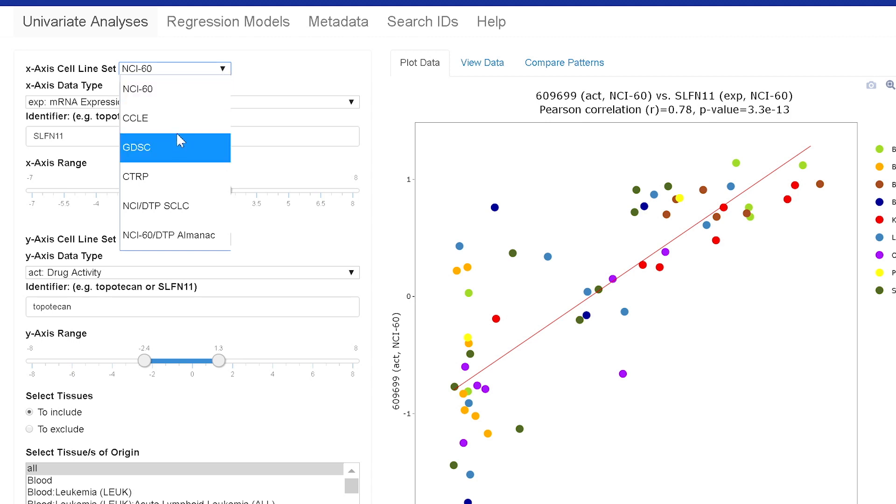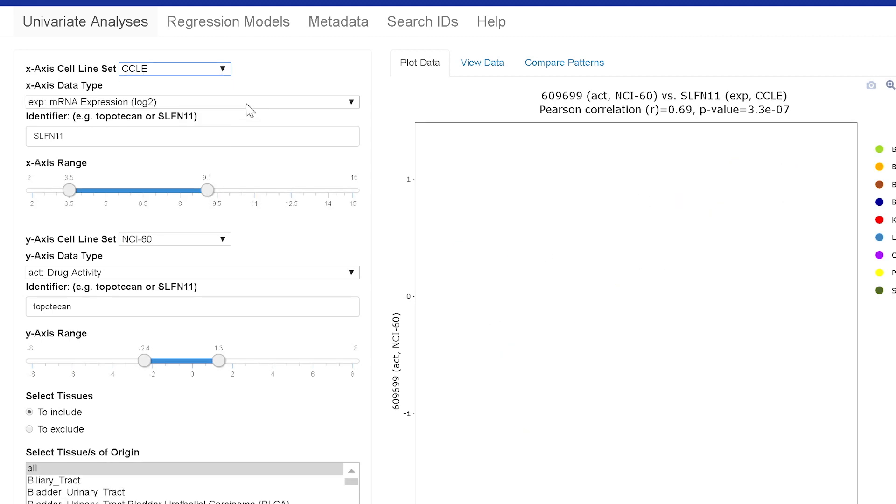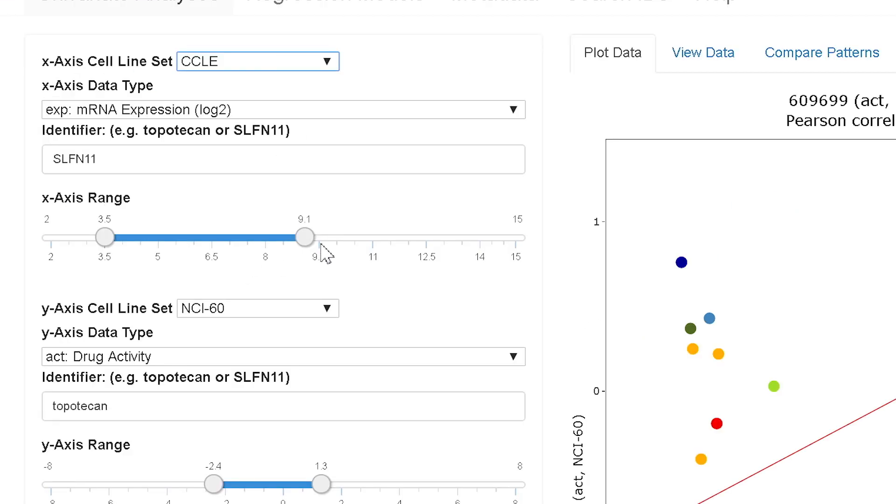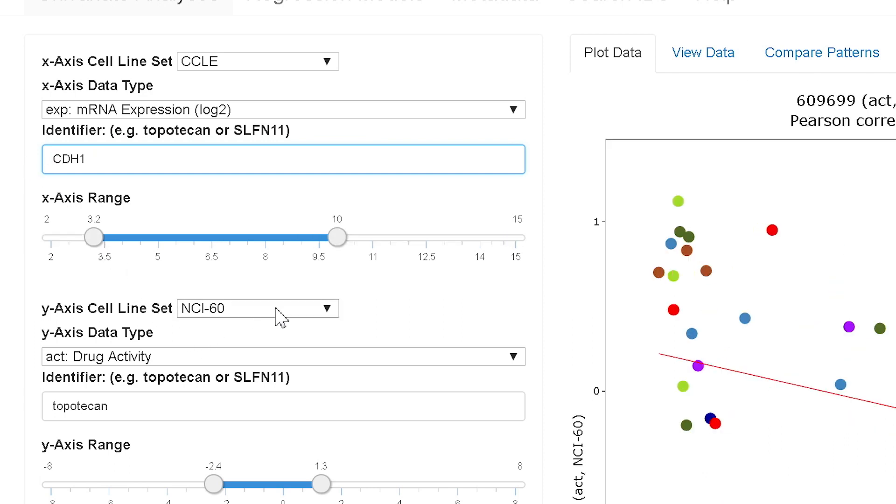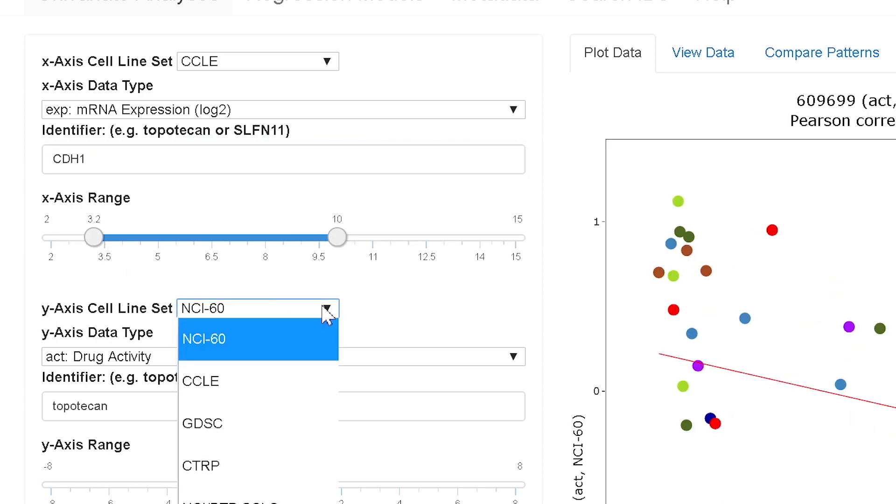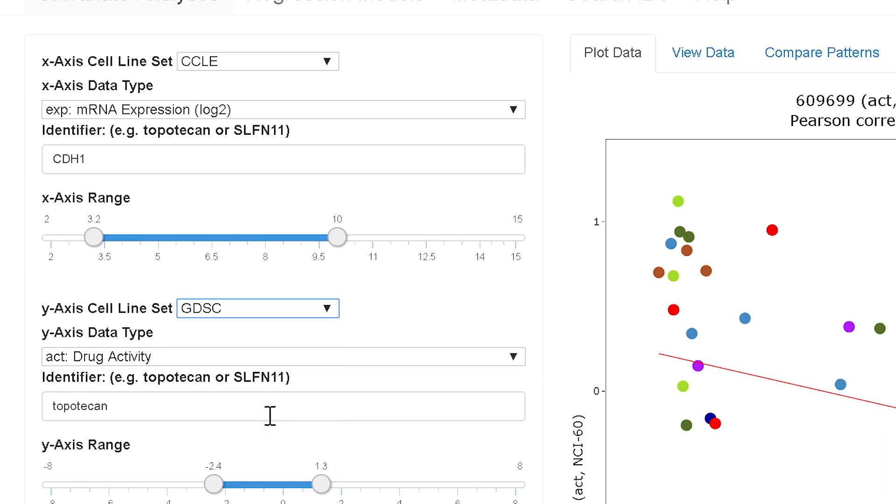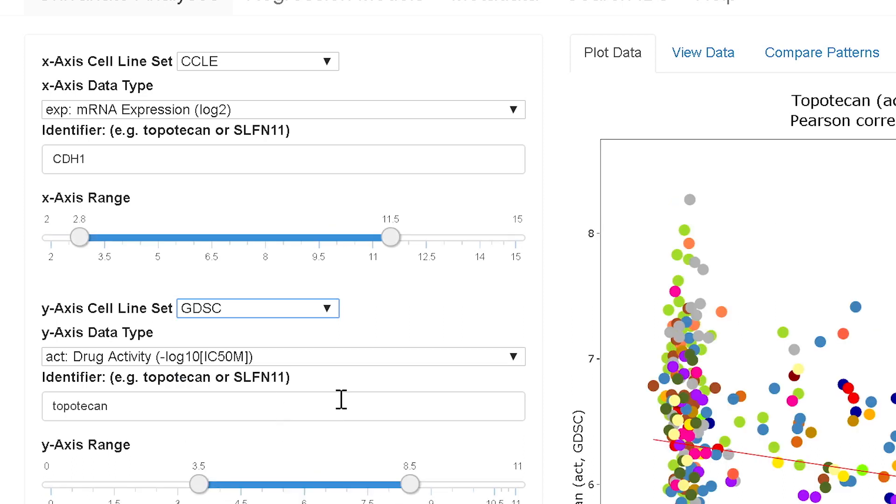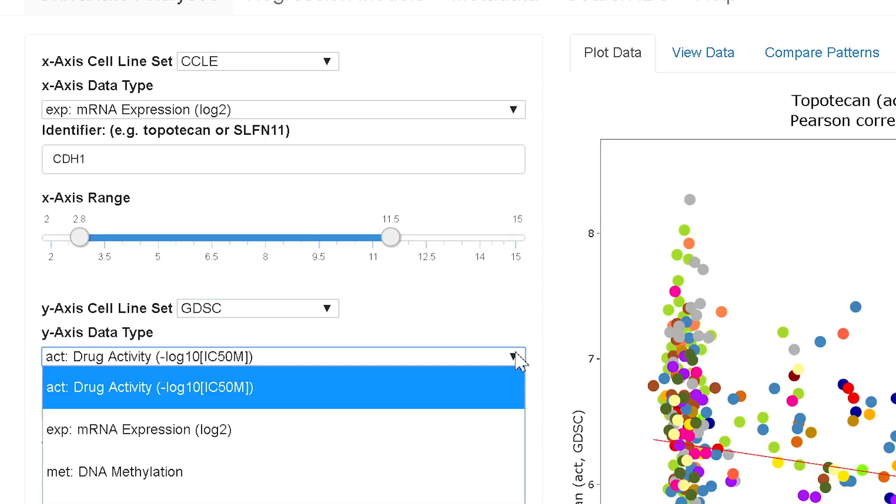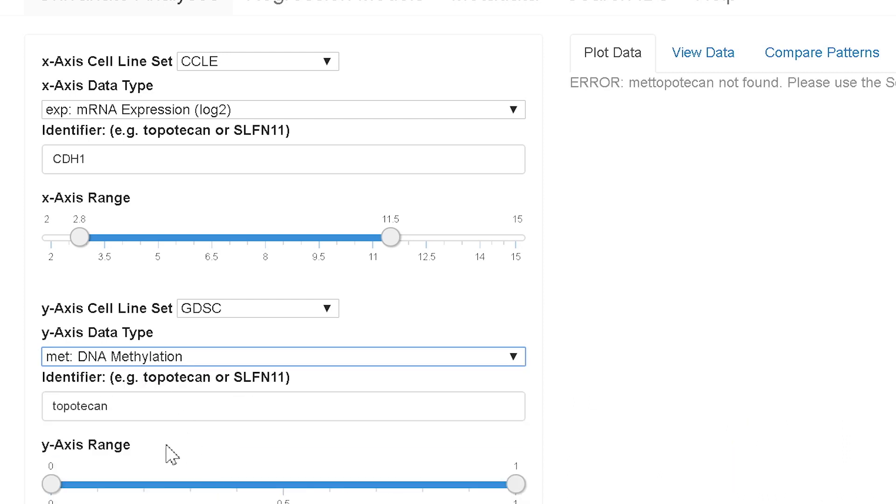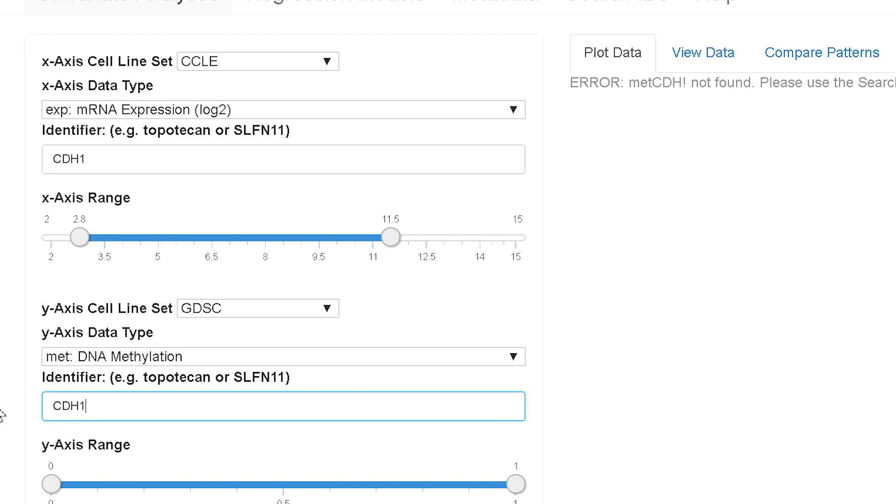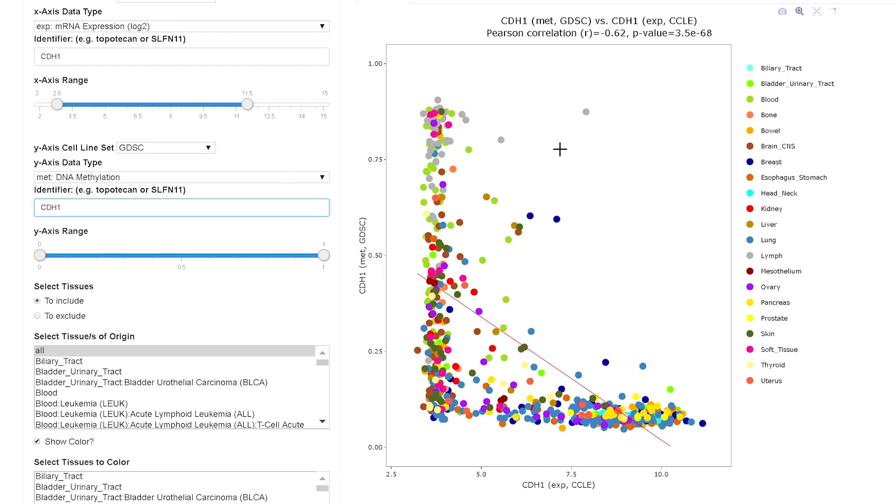I'll switch to a second example so you can see how things work. Now I'm going to the CCLE database, I'm going to change the gene, I'm going to go for the y-axis to the GDSC dataset. Going to DNA methylation, go to the same gene, this is ECAD here.